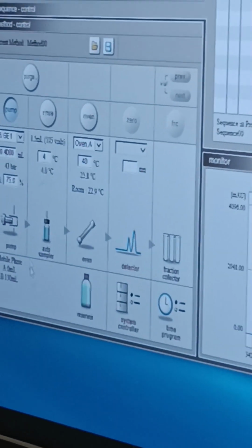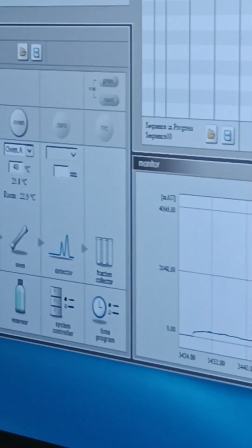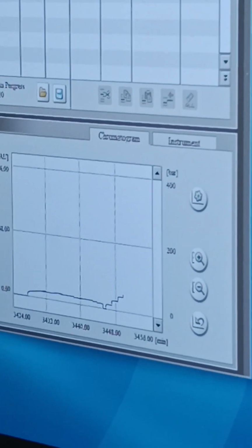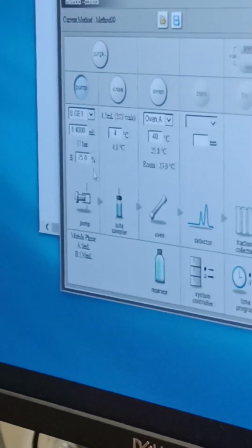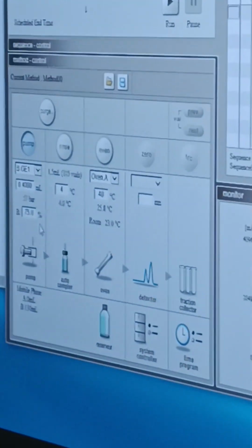And then now we change it to 0.4. We will increase up to, I think, 56, 57, somewhere around there. Then 0.5.